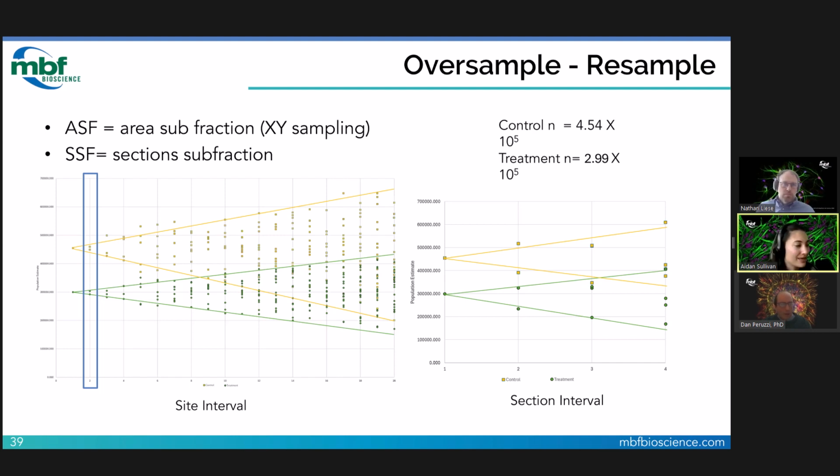So I think that I want to play it pretty safe. Yeah, I don't think that is dangerous at all to use half the sites, because the high estimate for the low mean is pretty far away from the low estimate for the high mean. And that's a good point that you made, that we have to keep in mind that our guard zones are going to cover up cells, so that's going to reduce our raw data. So that's another reason to be kind of careful about not going to number 3 or number 4 or reducing by a factor of 5. So I like that decision.